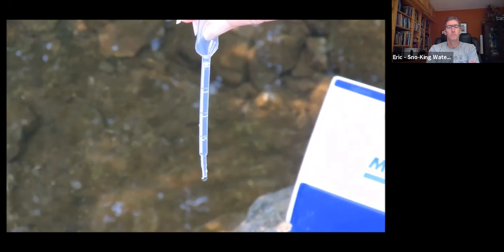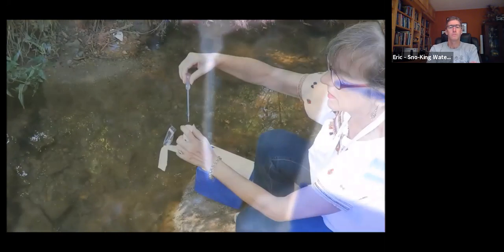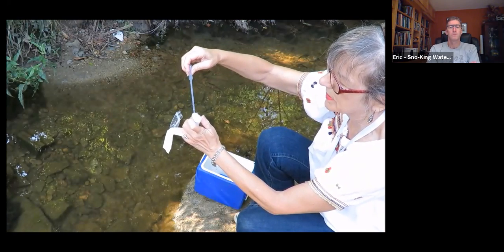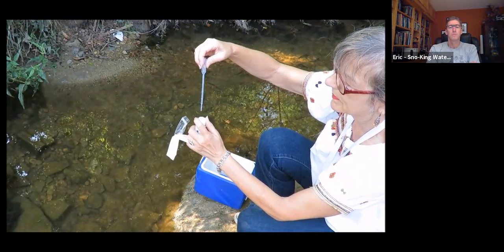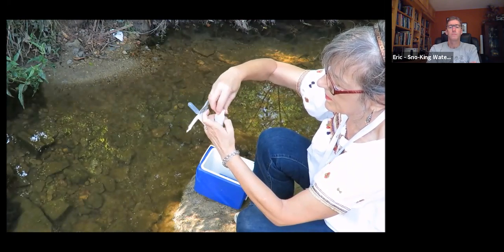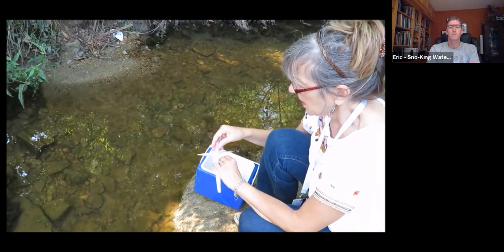Carefully squeeze the bulb and expel excess water to the desired sample volume. 1 milliliter sample volume is recommended and is usually sufficient. Be sure to use the same volume for each of the 3 replicates and record volumes on data forms. Remove the cap from the media bottle and hold it without touching the inside. Squirt the sample water into the bottle of liquid media without placing your hand or face over the open bottle. Cap the bottle securely and place it inside the cooler.